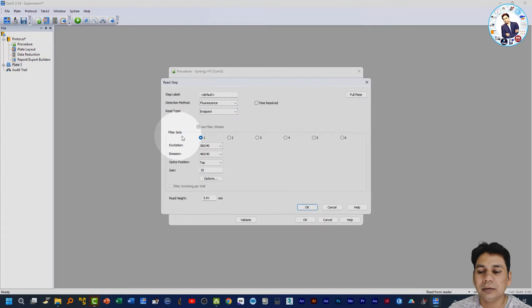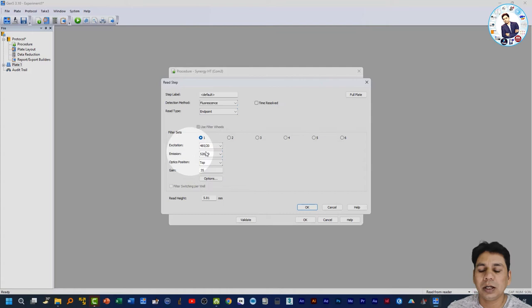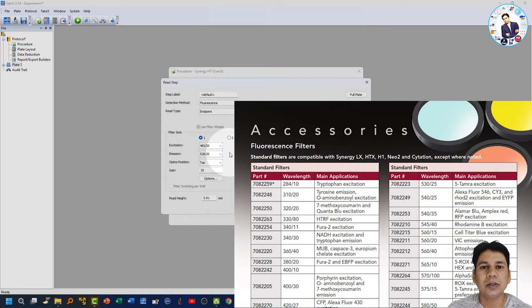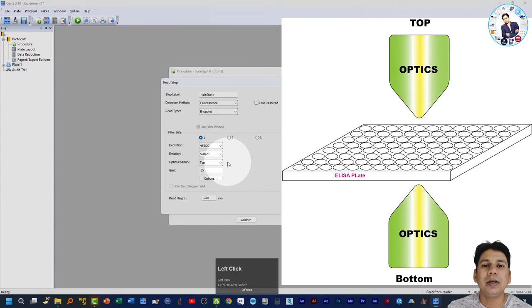Click on 'read,' select fluorescence as the read type, choose 'end point,' and set the filter. The excitation wavelength for my experiment is 485/20 and the emission wavelength is 528/20. Before performing a fluorescence ELISA experiment, please ensure that your BioTek ELISA plate reader has the desired filter set for excitation and emission. You can also select the optic position as top or bottom.